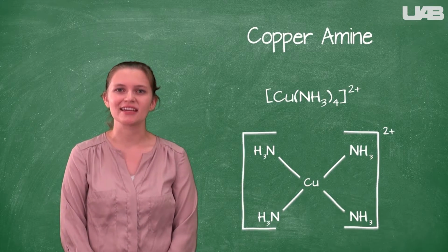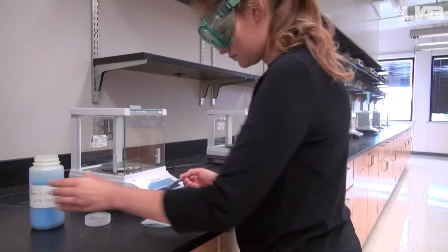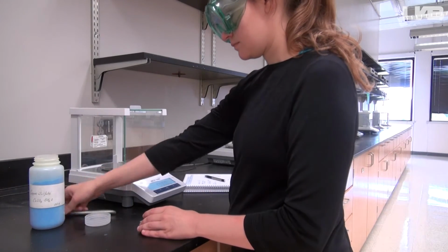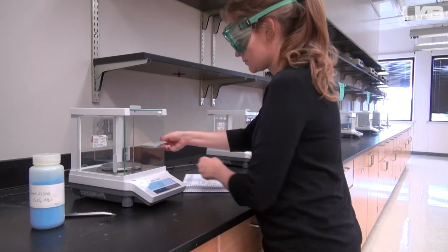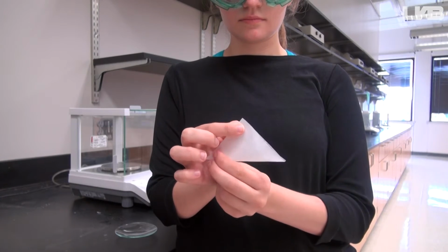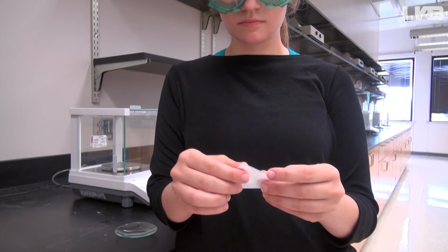You'll be synthesizing a complex ion called copper amine. Your first step will be to weigh out some copper sulfate pentahydrate accurately using the balance. Refer back to the earlier video on using a balance if you don't remember how. We recommend using some weighing paper because it will help you transfer the copper sulfate pentahydrate to the volumetric flask.